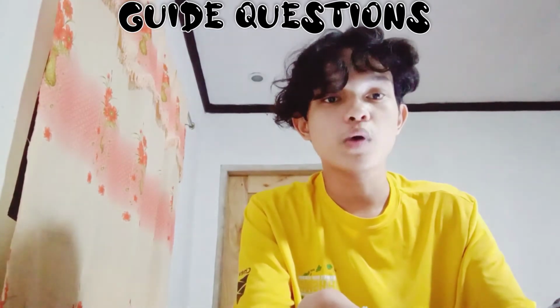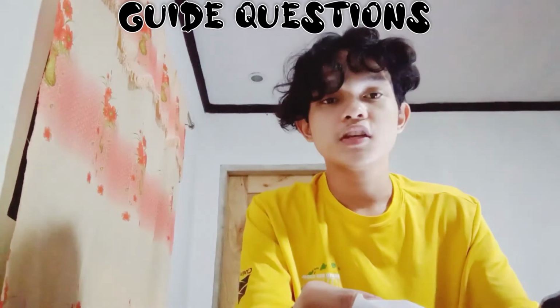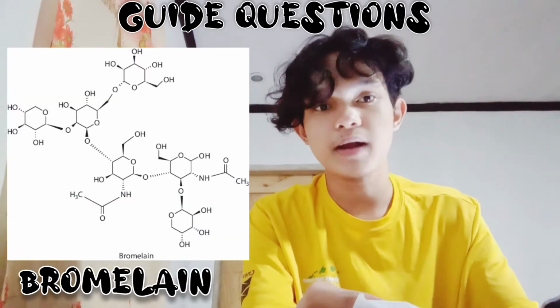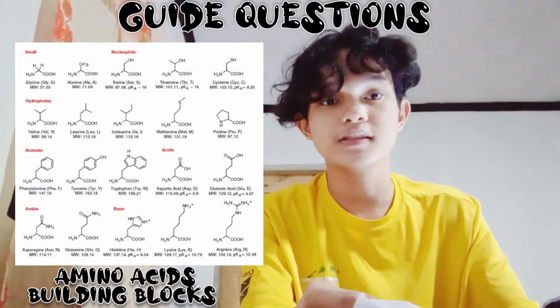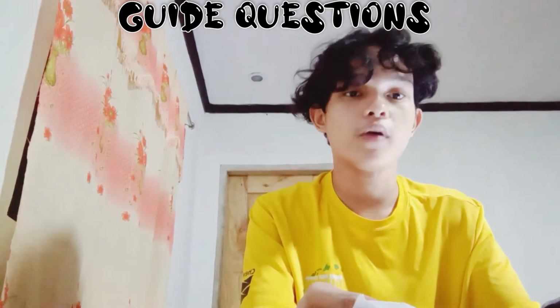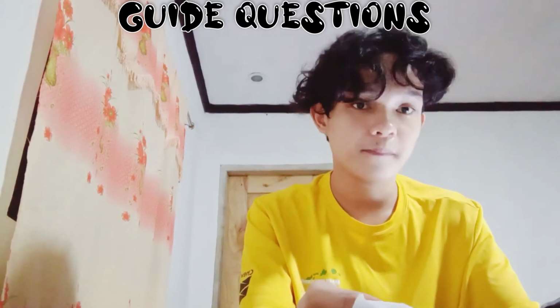Moving on to the second question, which is, describe the differences between the 2 cups. The gelatin in the first cup reacts with the pineapple due to the bromelain that breaks up the amino acid building blocks. That's why it liquefies. While the gelatin in the second cup doesn't show any reaction because there's no breaking down of amino acids happening.